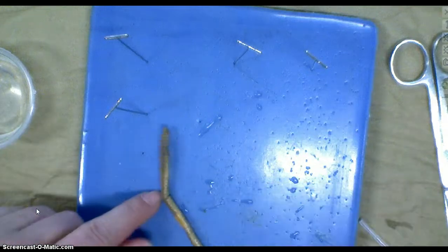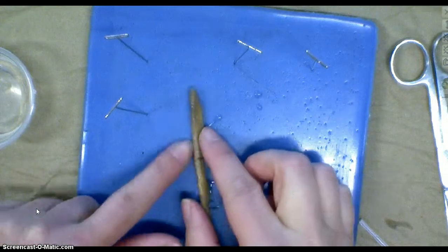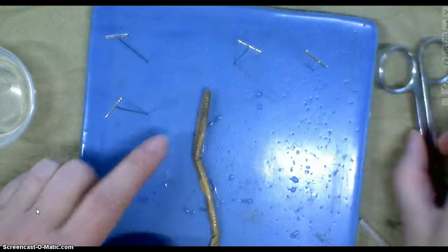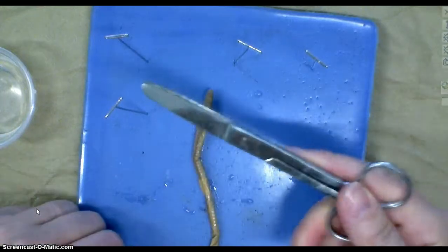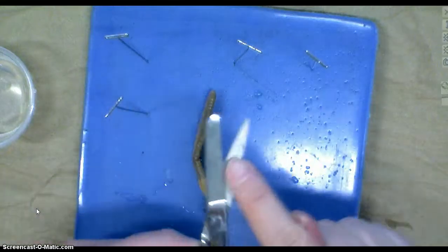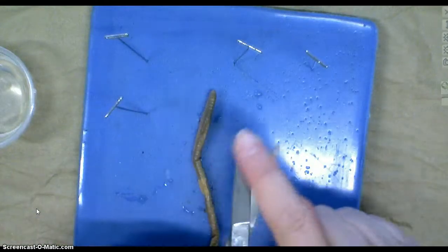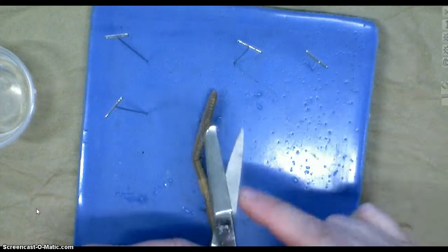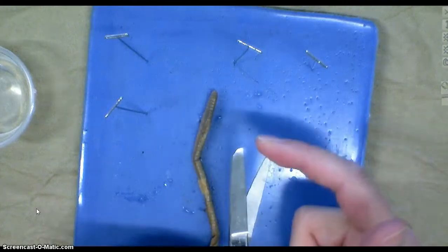Now, everyone gets all excited about dissection because they get to use sharp things and they think they're all cool. The only sharp thing you're going to be using today is the scissors, which we are going to make some points about. Notice it has a pointy end and a blunt end, and they are built that way for a specific reason. The first time you go to make an incision, you do put the pointy end down.